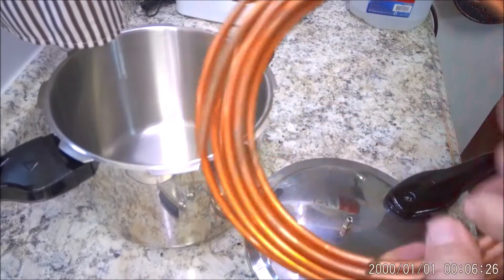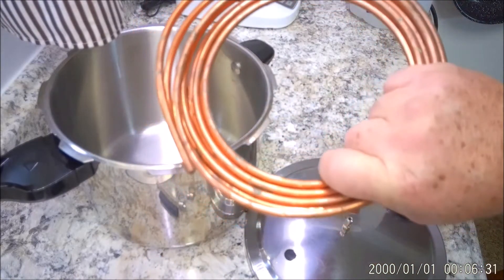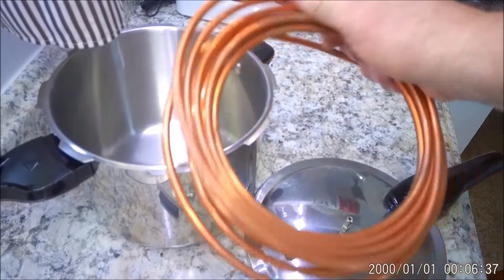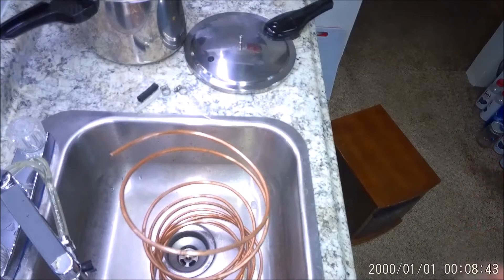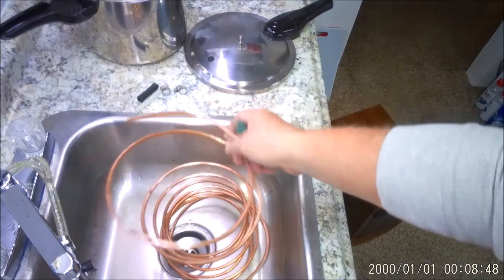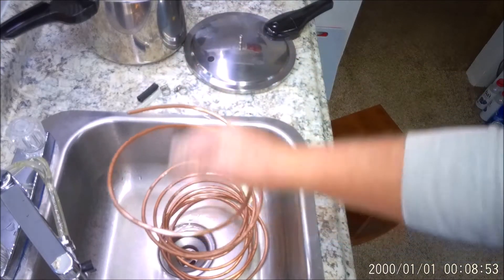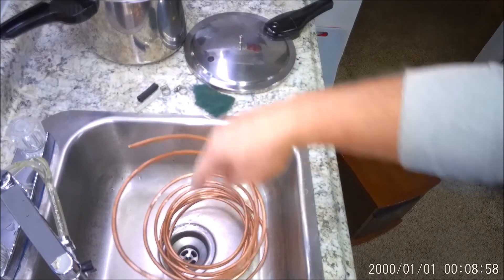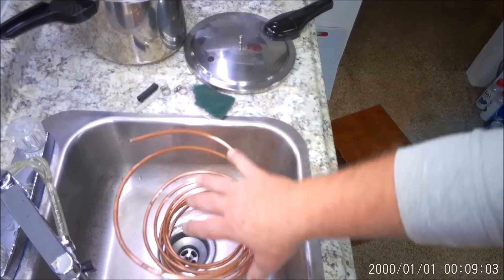I'm gonna clean this copper tubing up a little bit. You don't have to because it's just the outside — your water is all gonna be on the inside of the tubing. But I just want to make it look a little pretty. Okay, we're a little scuffed up now, looks a little better. Nothing fantastic, doesn't have to be. I'm gonna wrap this around a can and coil this a little tighter to make it a little more compact.